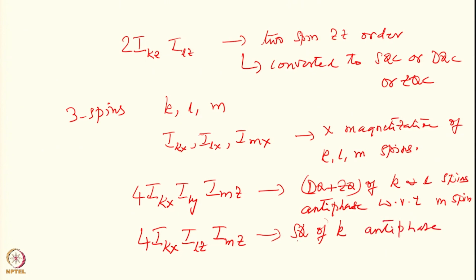Single quantum, what? Transverse magnetization, X magnetization, antiphase with respect to both L and M spins. These will generate different kinds of terms when you actually do a measurement.